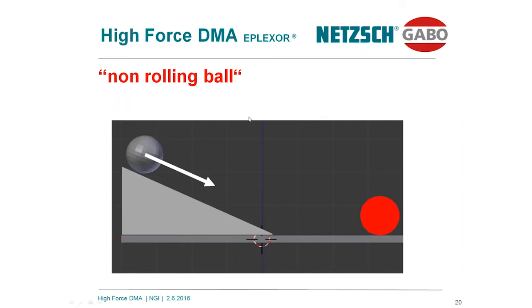but believe me, the materials have almost the same hardness. So our hardness is very close for these samples, and the question is, can we distinguish these materials in a conventional universal testing device?